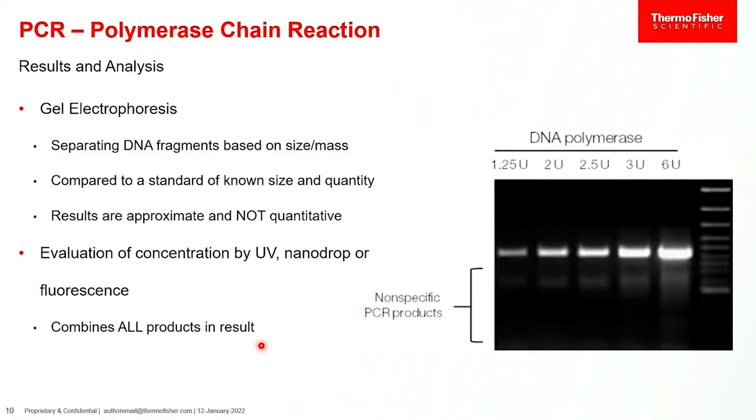So we have to be really careful when we go through this design process and developing an experiment. A lot of people talk about, oh, I just throw in some primers and it works great. But if we actually do this well, there's a validation that happens up front that makes sure we only made one thing, and we made exactly what we wanted to. And it's not trivial. If you do it properly, you can do it well.